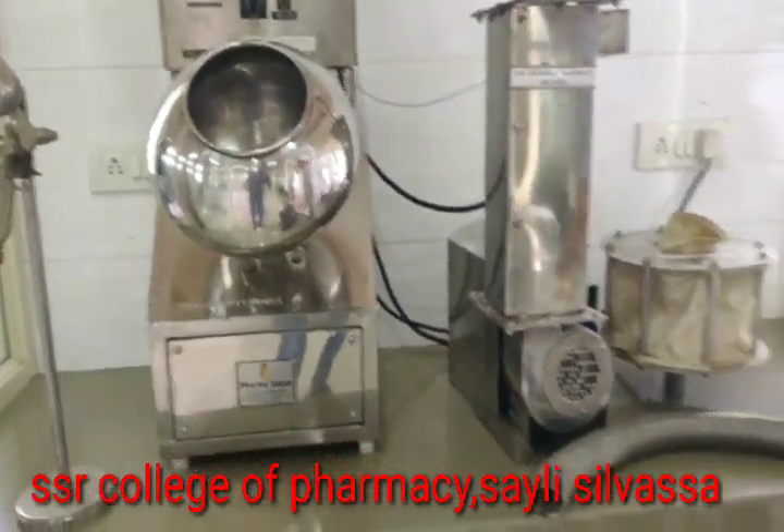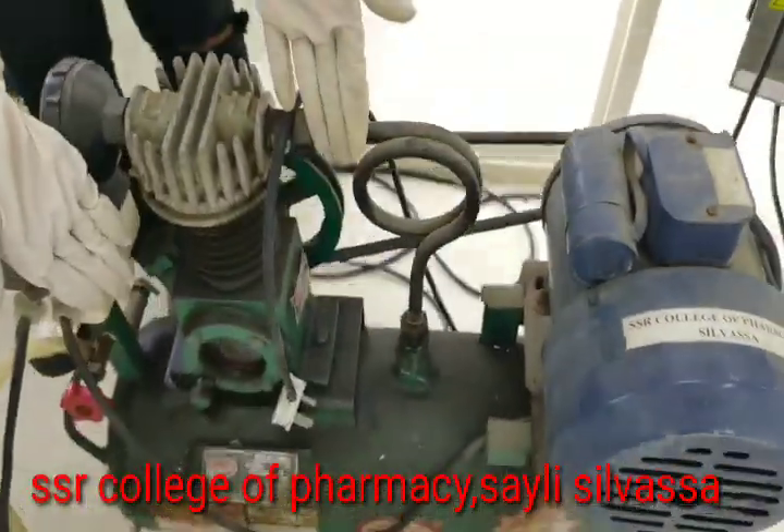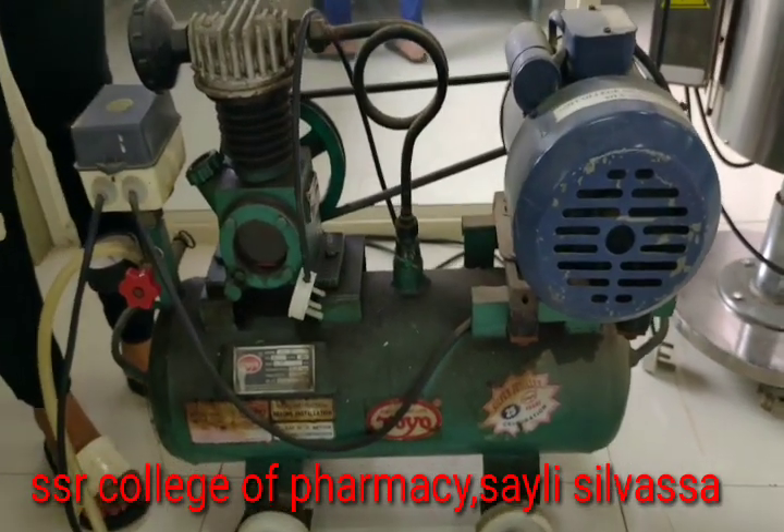Then we have the main drive. This is the motor through which the electric supply is given, and this is the air compressor which we use.